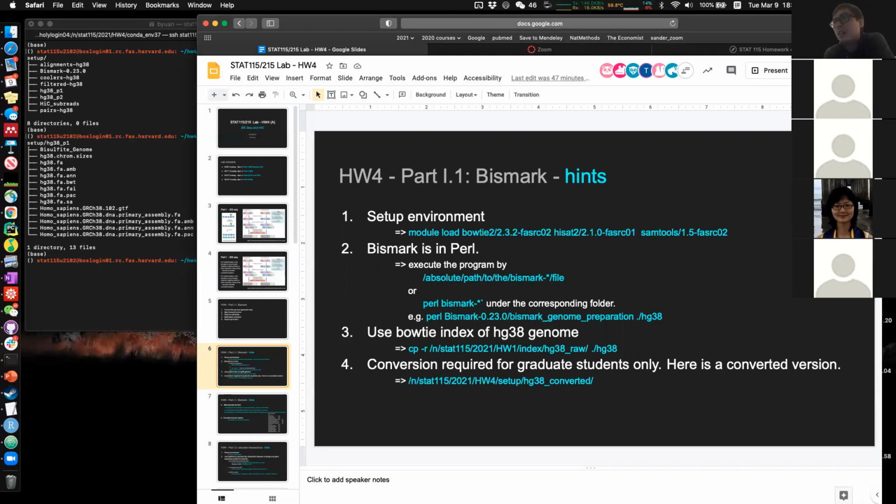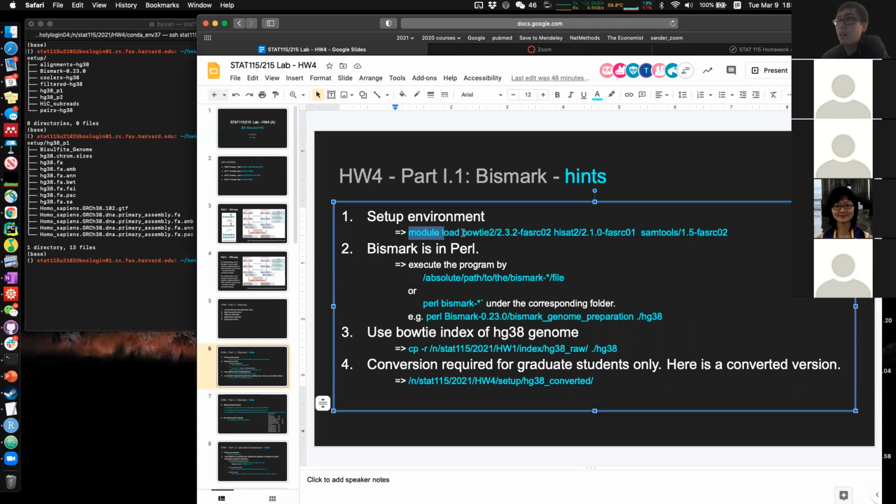So first, as we needed before, we need some alignment tool. So we use this Bowtie indexing file. I think we used them before, so we are going to use that again. Since we are using this Canon server, well, apparently you can use your local machine, but we recommend you use the Canon server. Then you would have to go through their module manager system.